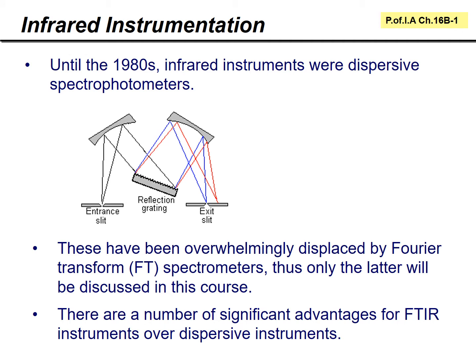So perhaps the first thing to start with is just to point out that infrared spectroscopy is an absorption-based measurement, just like UV vis, however, with electromagnetic radiation in the infrared part of the spectrum. So infrared light is brought upon a sample and the amount that is transmitted is measured. The difference is what's absorbed, and that's how you get an infrared absorption spectrum.